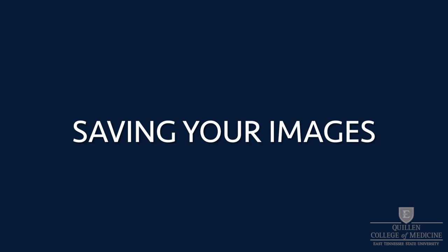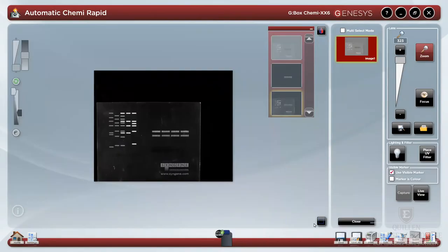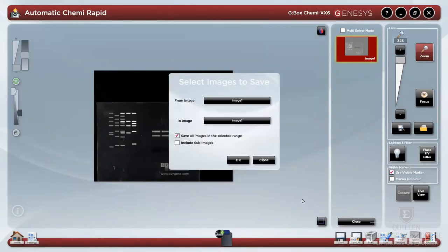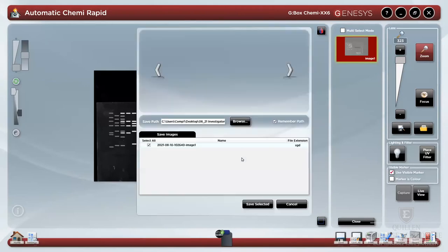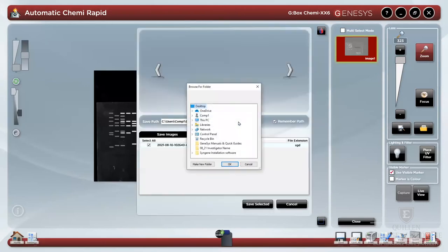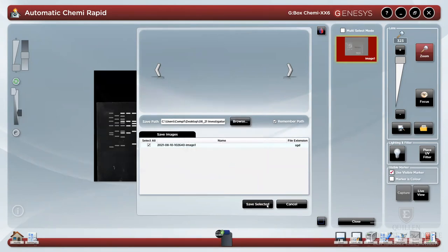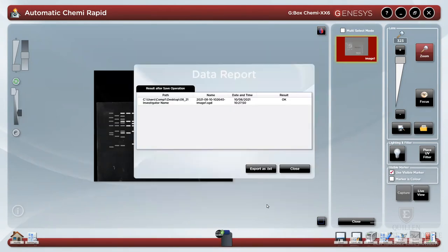Be sure to save your images before exiting. Use save to save your data as a .sgd file. This is Syngene's proprietary file type that contains all of your metadata. You may save your file either to a folder that has a date and investigator name or to your own thumb drive. Folders saved to this computer will be deleted each month, so be sure to back them up as soon as possible.